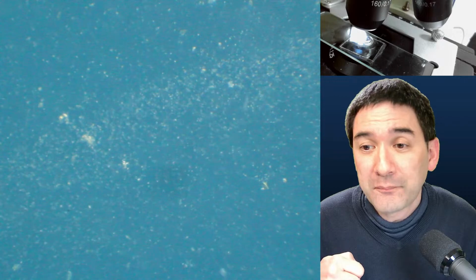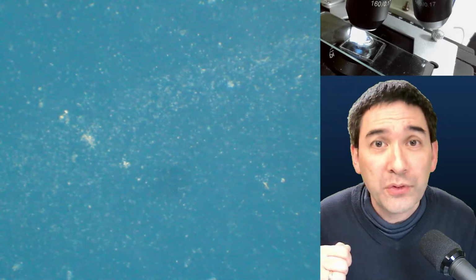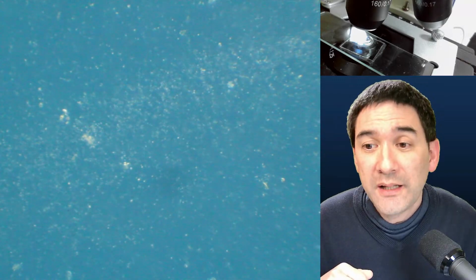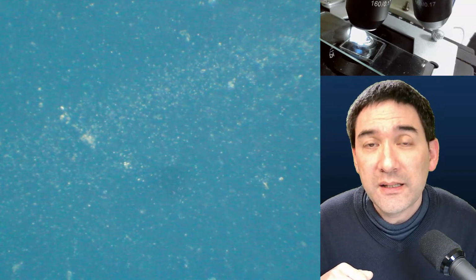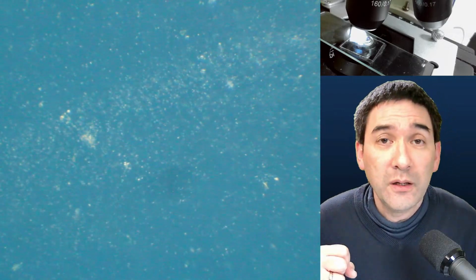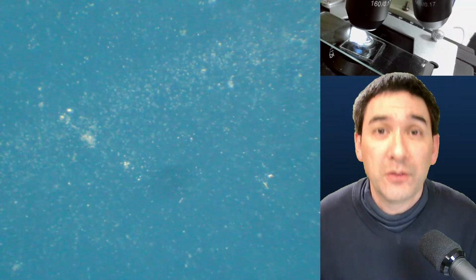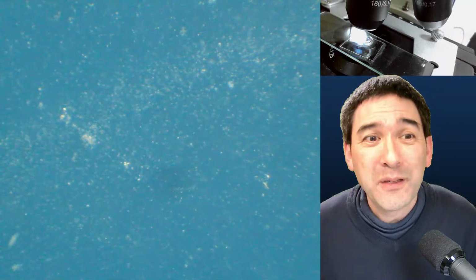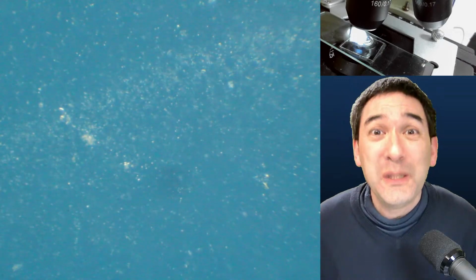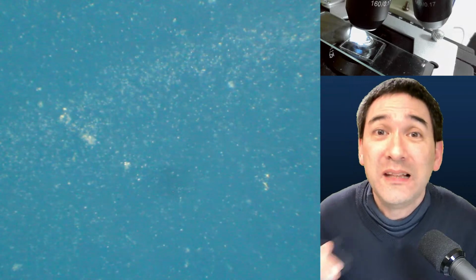Basically, Ernst Abbe is super important in light microscopy because he set the theoretical resolution limit. And the thing is that many beginners, I would say, think, well, if you want to see something under the microscope, just go up with the magnification, just make it bigger, right? But there's no point in making something bigger because it simply becomes bigger but more fuzzy, so you're not able to see more. And this is basically what Ernst Abbe has calculated. What is the limit? Yeah?